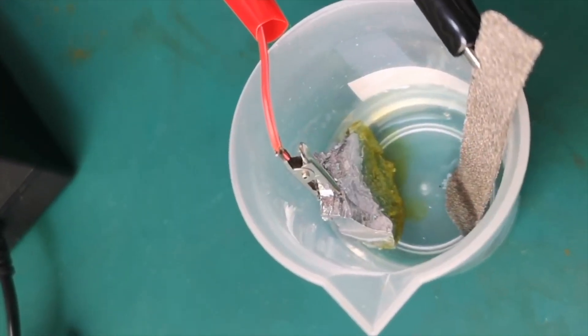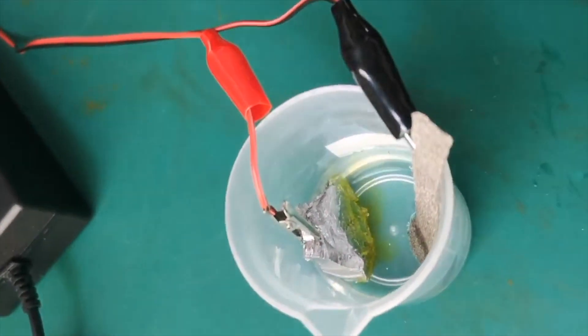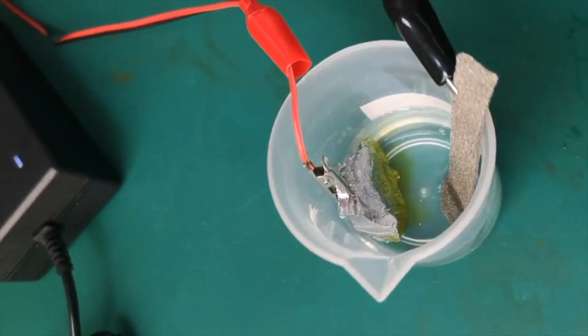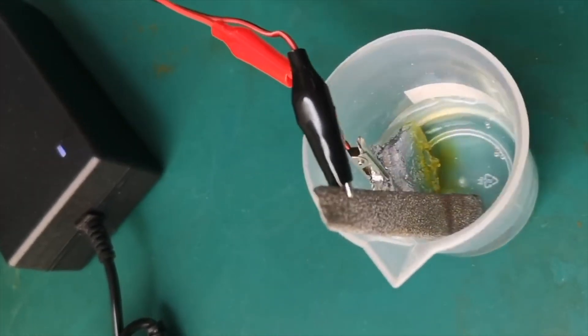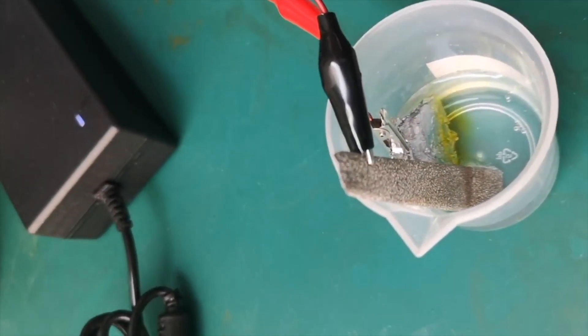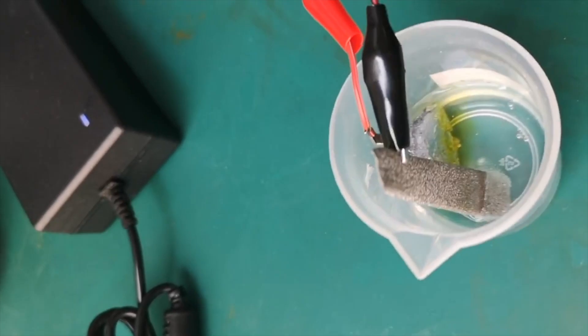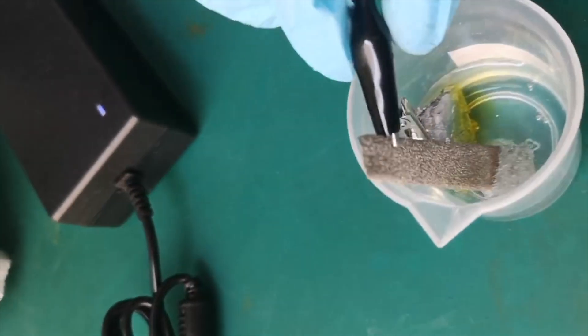For the first test, I took some sulfuric acid that I got on hand from last time. I connected the anode to the piece of chromium and the cathode to foam nickel. Here, the solution is already slightly colored since I switched on the power beforehand.